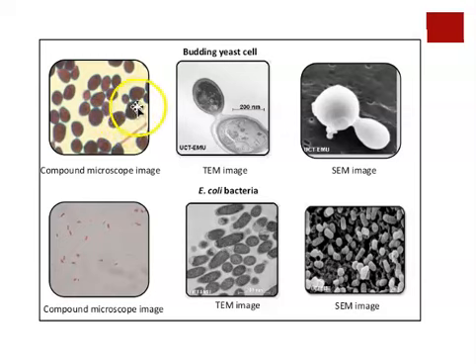This cell, for example, right here, has a bud coming off of it. Under the electron microscope, not only can I see all kinds of detail of the parent cell, I can see individual organelles in this parent cell. I can also see internal details in the bud.